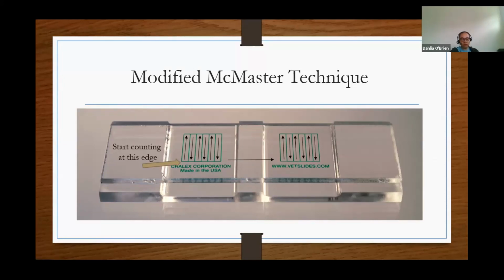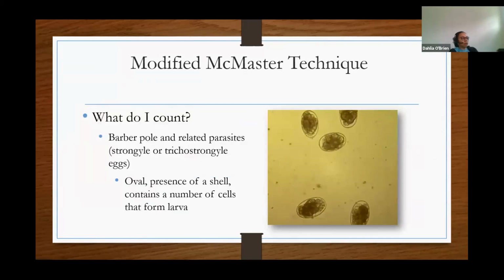And then once you're done with that chamber and you move across, it'll come to the end of the slide. So even if you're too into counting, you'll know that you've counted both chambers and not question, did I count both chambers or not? So that helps you to ensure that you're counting both chambers, and that you don't have to start over because you forgot where exactly you were.